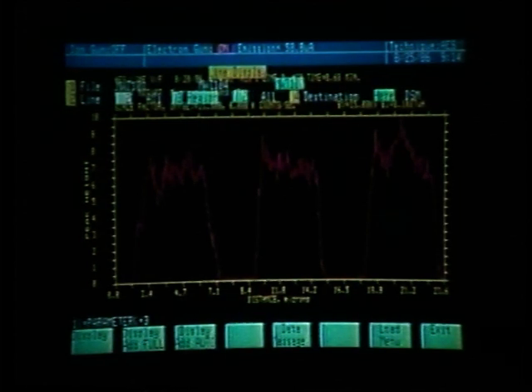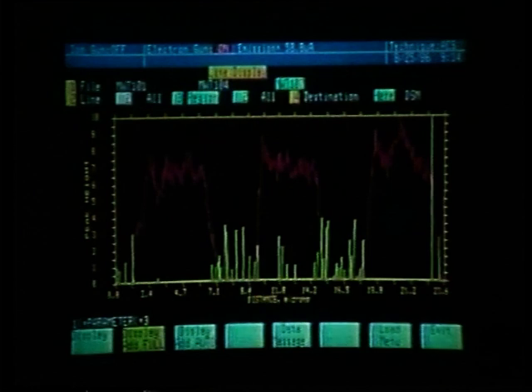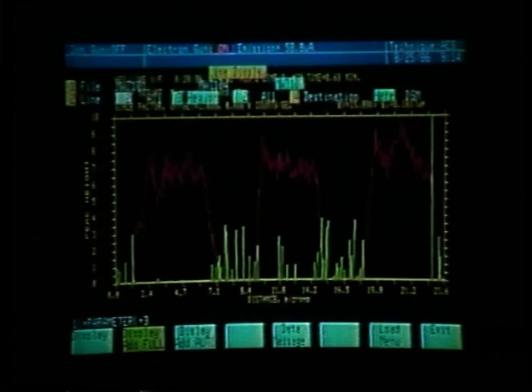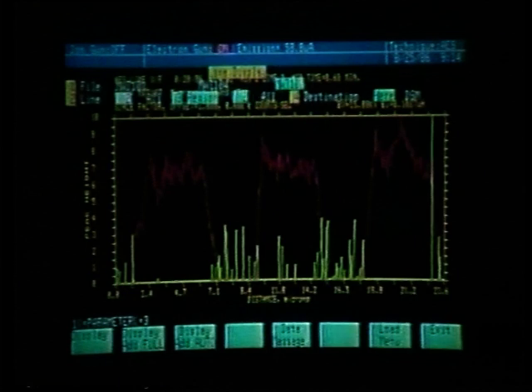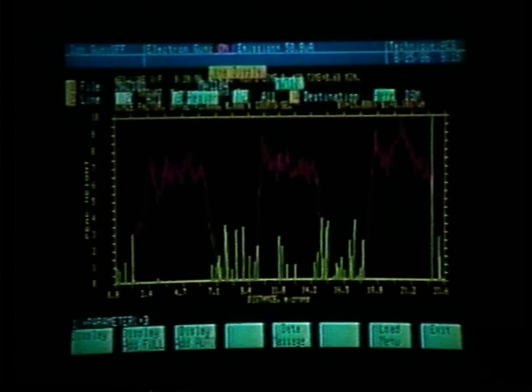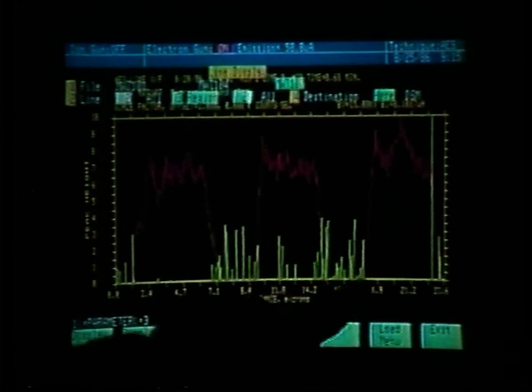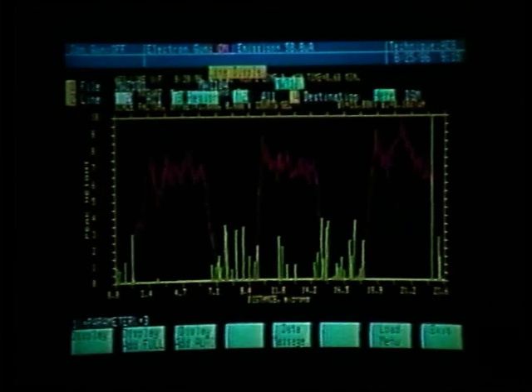And we want a display add full, soft key number 2. Once again, in looking at this signal, we see noise level, no real information from the tantalum. Line number 2 was the line which went across the wide gold pads. It looks like we have no tantalum information in that line scan.